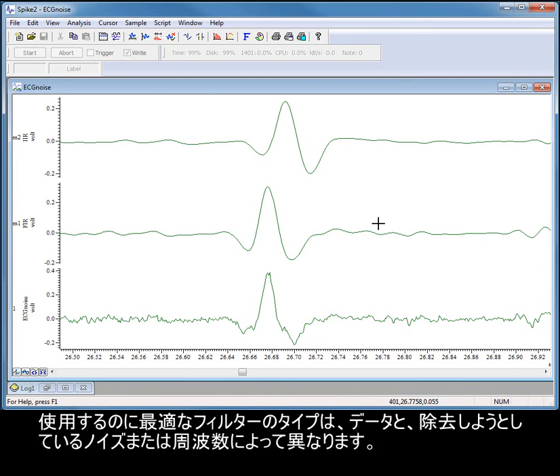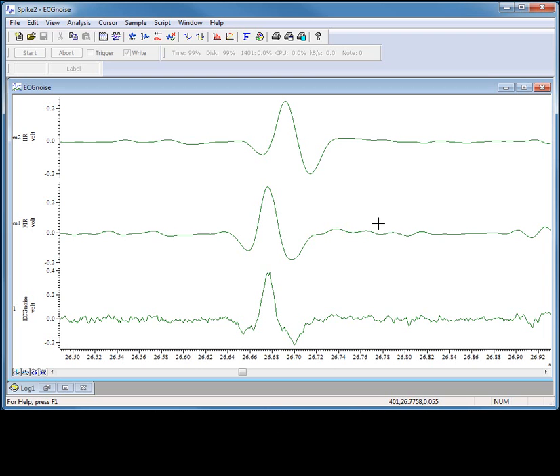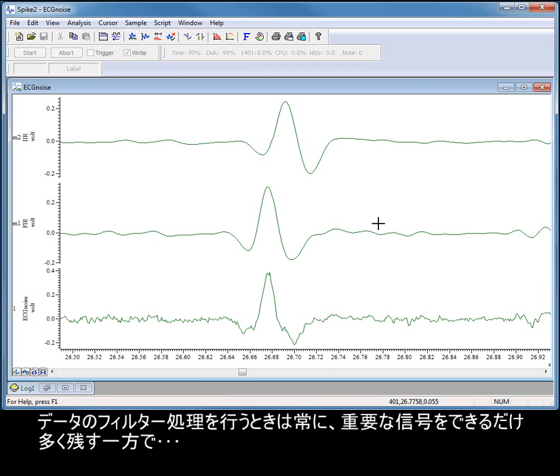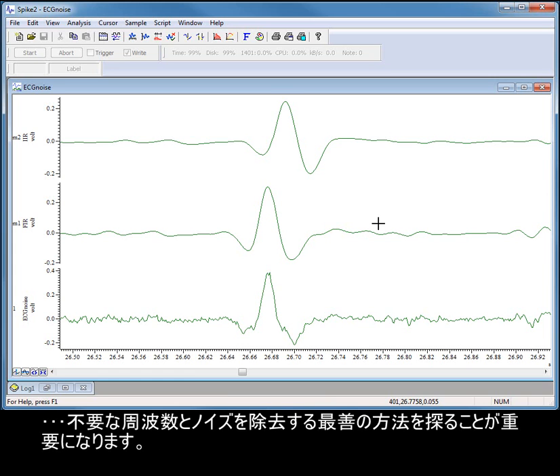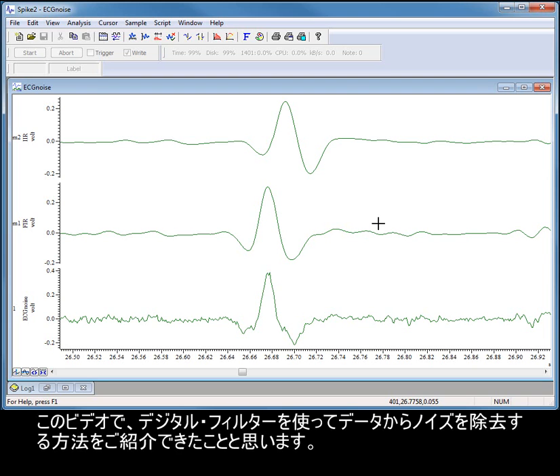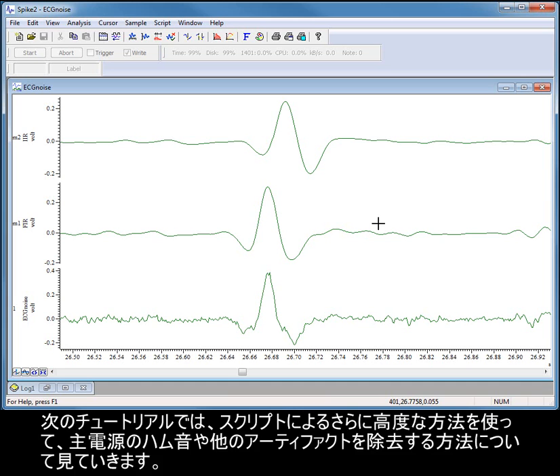The best type of filter to use depends on your data and the noise or frequencies you are trying to remove. When filtering data, it is always a matter of finding the best compromise between removing the unwanted frequencies, while preserving as much of the signals of interest as possible. I hope this video has given you an insight into how to use digital filters to remove noise from your data. In our next tutorial, we'll be looking at how to remove mains hum and other artefacts, using more advanced scripting methods.